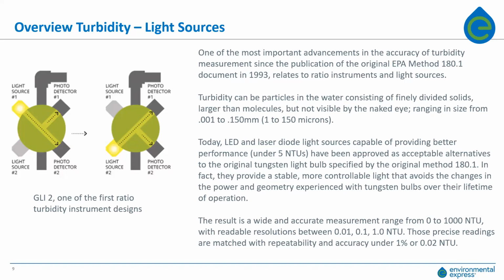Units. So for a Formazin nephelometric unit, the FNU, that is similar to the nephelometric turbidity unit, the NTU, in that both measure scattered light at 90 degrees from the incident light beam. Now, the FNU unit is equivalent to the NTU unit and is measured normally with an LED of the infrared light source according to the ISO 7027 method, whereas the NTUs are used with a white light source, such as method 180.1.